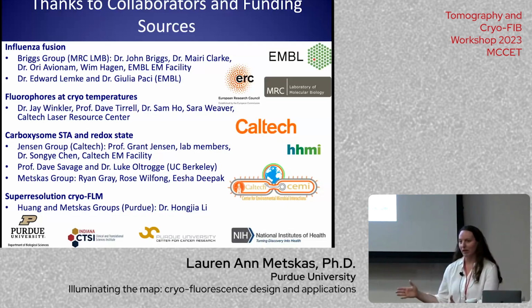I've actually spoken with a lot of different cryo-CLEM people, and the number one message I get is, please don't design new fluorophores. Figure out how to make the current ones work. Now, the Myrna group has developed one. I'm actually not sure that they developed it. They may have just characterized it, but PAmKate, which is a far red photo-switchable fluor. Photo-switchable fluors usually don't work well in cryo, so that's an unusual one. I'm actually very interested in working with Thermo Fisher because we want to get the resolution improved inside of the FIB-SEM. So we're getting an Arctis with the iFLM insert, and we actually already have the collaboration set up to try to improve that light path. So yeah, please tell them. I'm happy to collaborate.